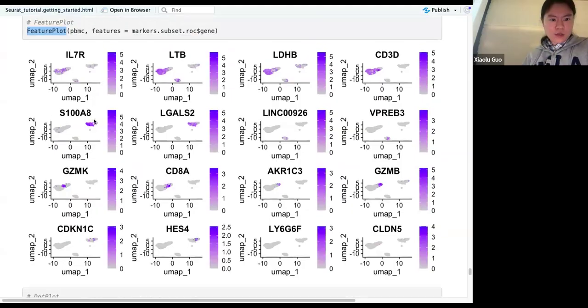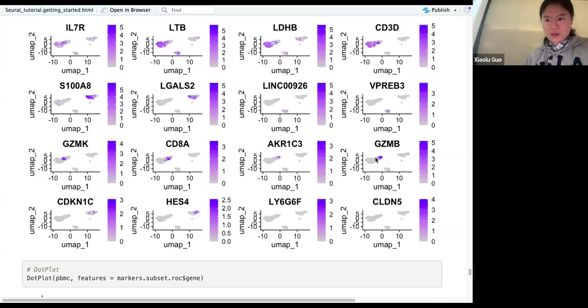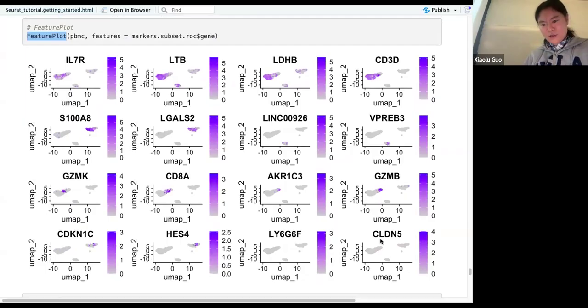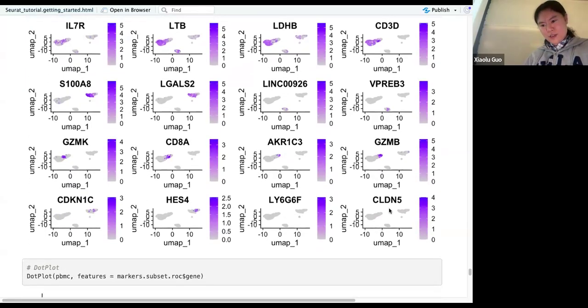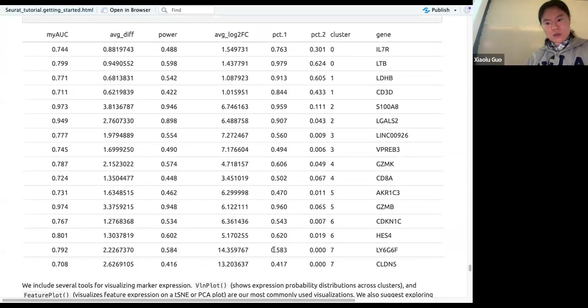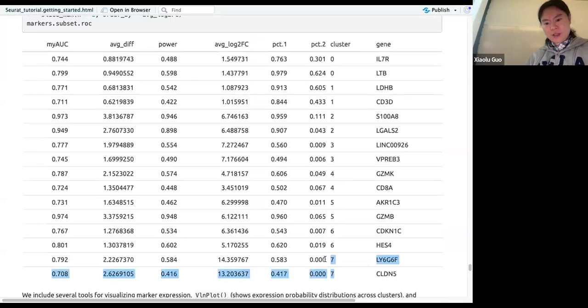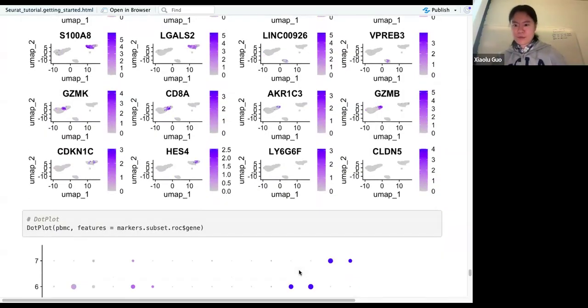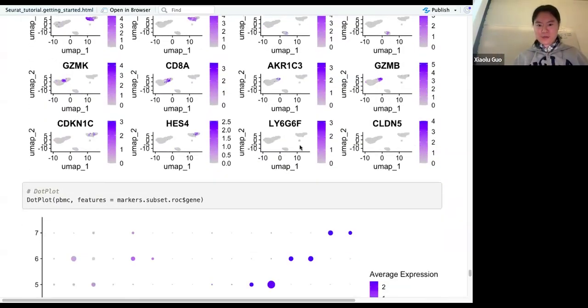And so this is for this cluster. Okay, and so on. It identified some genes, and some of these are not good genes identified by this test. It doesn't have a cluster. Okay, there is some issue here, since we don't see anything. Do we see anything? Yeah.